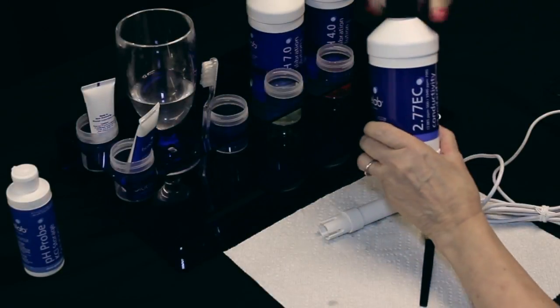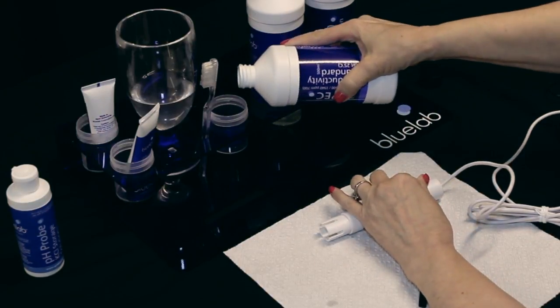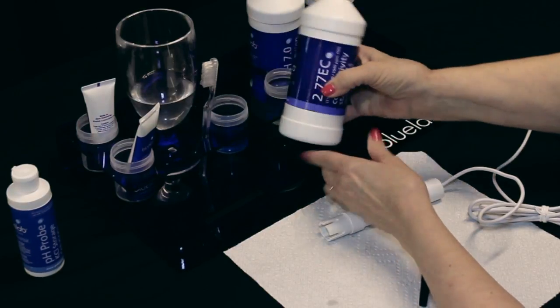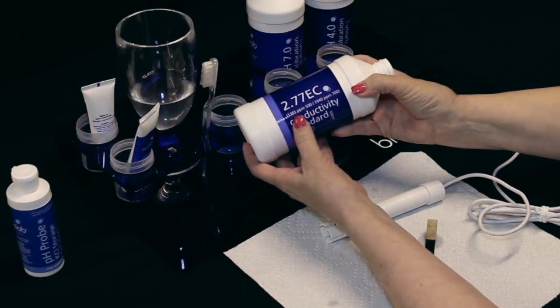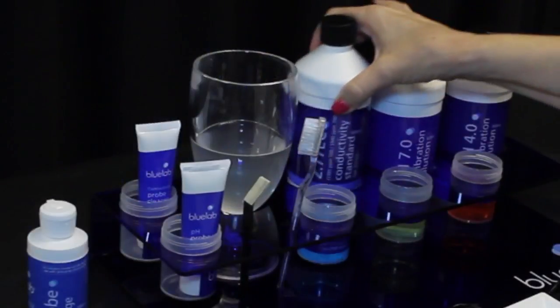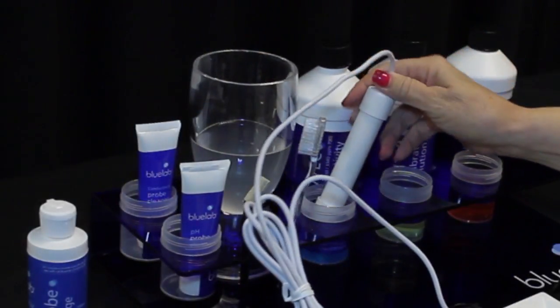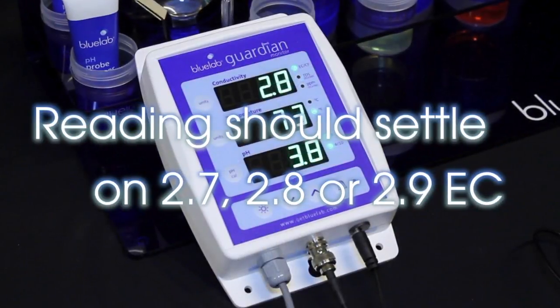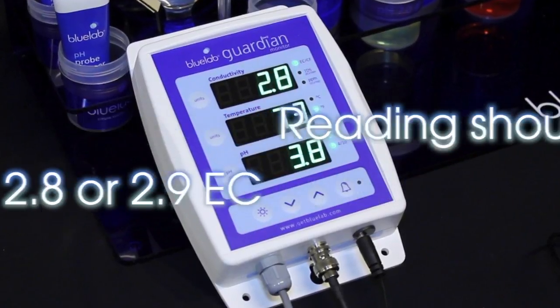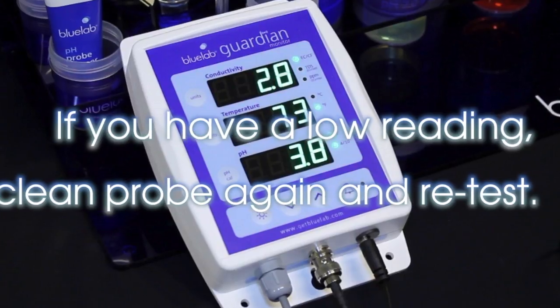Test the probe in a known solution to ensure it is clean. There are many PPM and EC testing solutions on the market. Use Bluelab solutions with Bluelab products to ensure the highest level of accuracy. To test, place the probe in freshly poured Bluelab 2.77 EC Conductivity Standard Solution. Wait a few minutes for it to compensate for temperature. The reading should settle on 2.7, 2.8, or 2.9 EC. If you have a low reading, clean the probe again and retest in fresh solution.